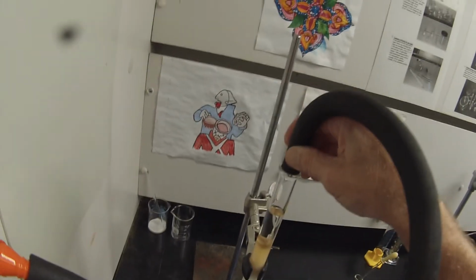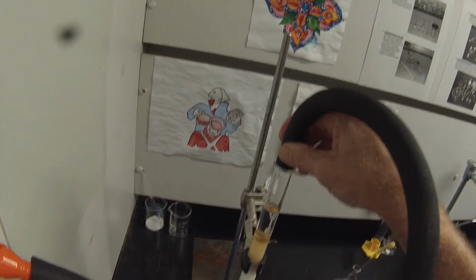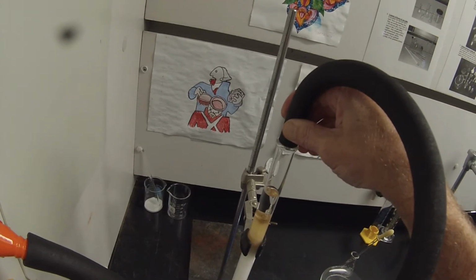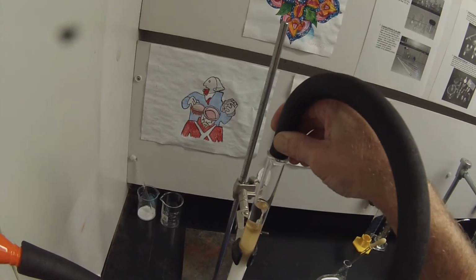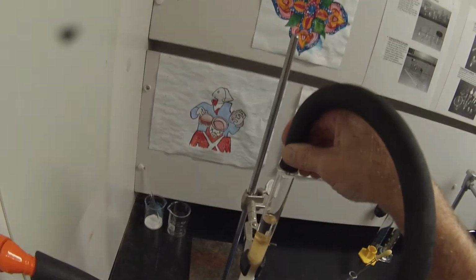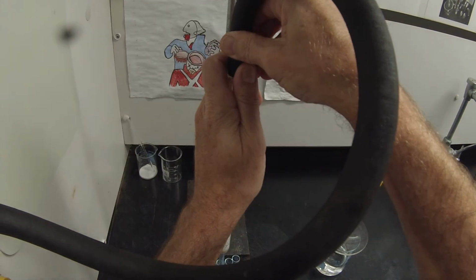So I'm probably actually collecting closer to 6 milliliter fractions than 5. Going a little bit further above the pins than that 5 milliliter measurement was. And especially on the early fractions, since I think nothing's coming off yet, that's justified. It's not quite flat, so it's a little hard to adjust the flow rate.